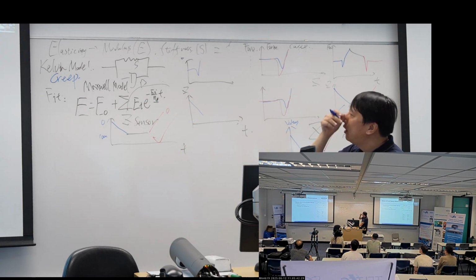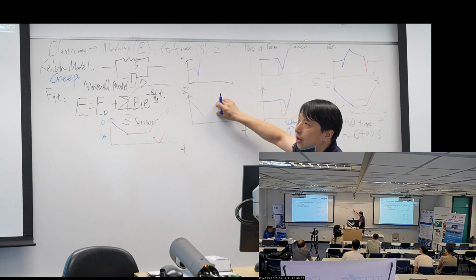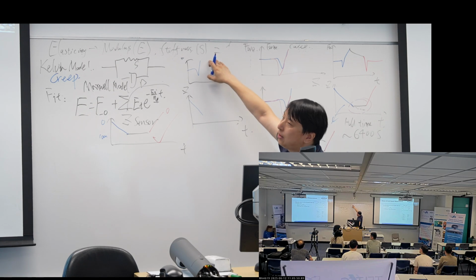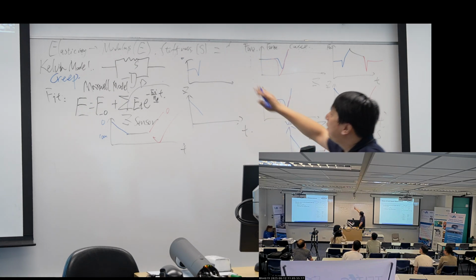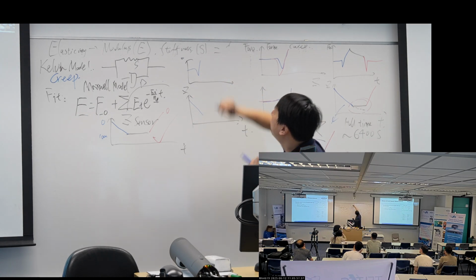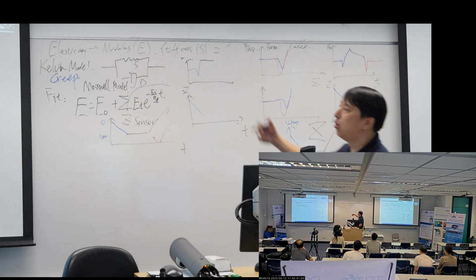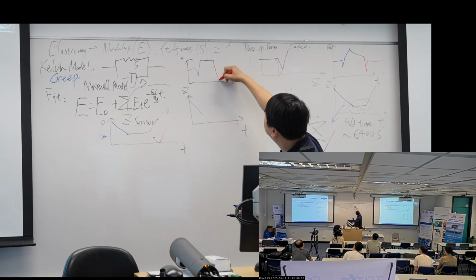For the creep, they want to hold the force, and to see how the deformation or how the strain is changing. And so at this time, we would make sure the force is a constant, and we would hold it for some time, and then I retract.